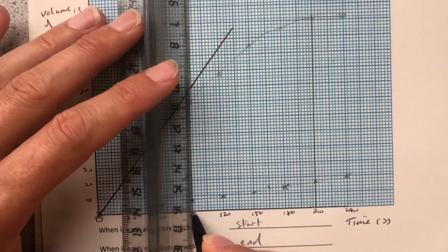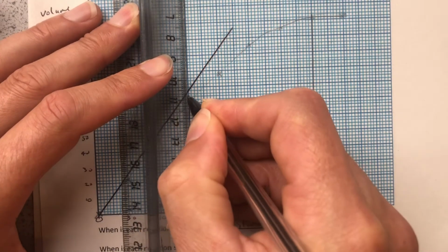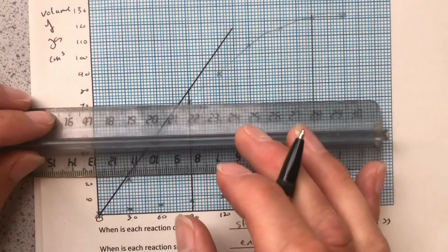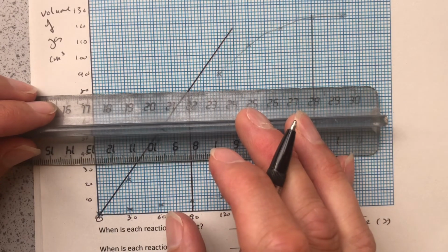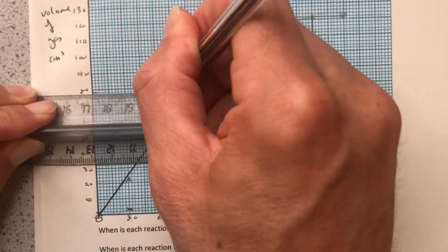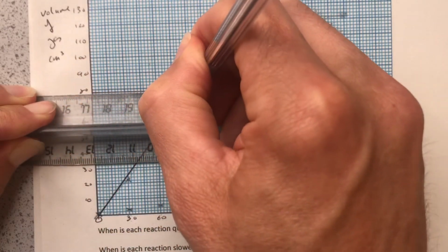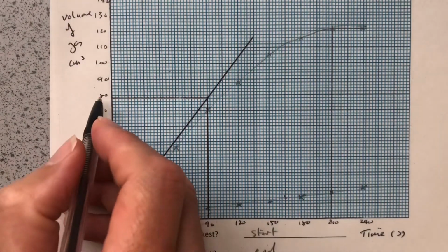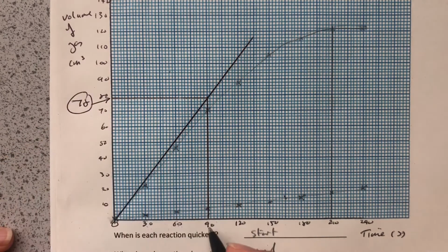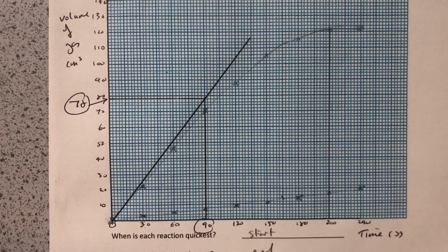Okay, and I'm going to rule up to that straight line now. Again, pencil's better because it means we don't make mistakes. I'm just conscious the pencil won't show up very well on the video, so hence I'm doing it in pen. And where it gets that straight line, we rule it across here. Now that's coming in there at exactly 78. That was 90 down there. So my x-axis is 90, my y-axis is 78.